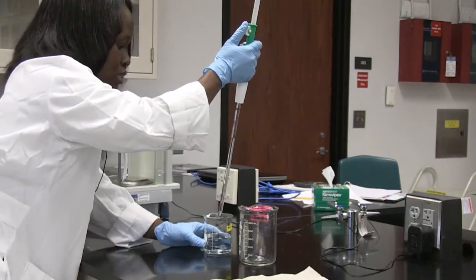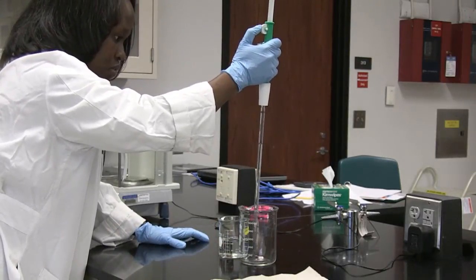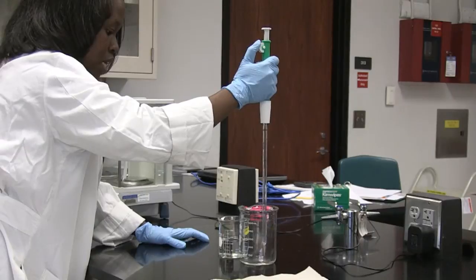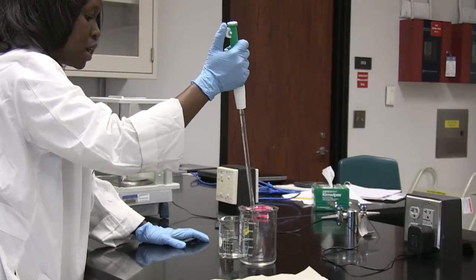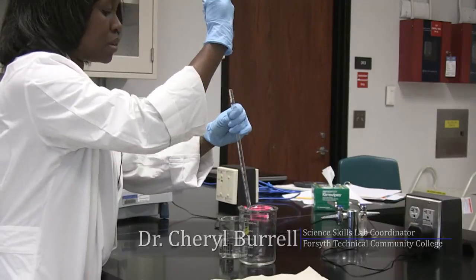I'm going to transfer this sodium hydroxide solution into my other beaker. This time I rotate my wheel in an anti-clockwise direction to aspirate my liquid. So I have transferred 10 mils of sodium hydroxide from one beaker to the next using a serological pipette.